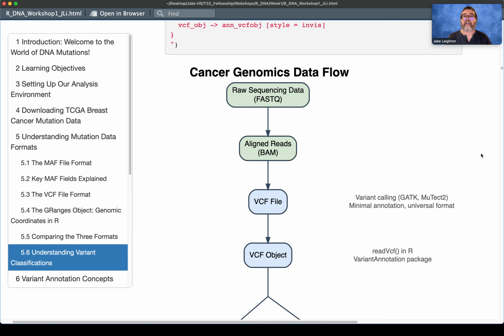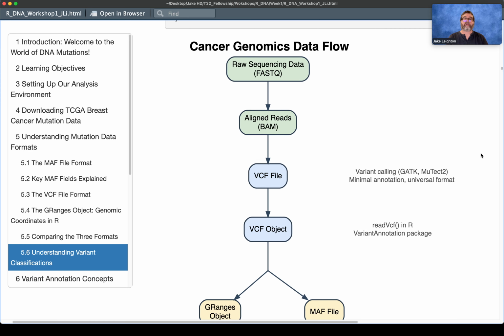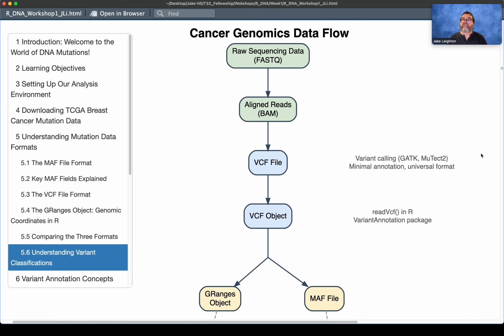So now you know a little bit about the overview of those files, and this is how they go together in a basic cancer genomics workflow. So when you do a sequencing run, let's say we're looking at mutations, you get all the data, and it's really a big mess and complicated. The first thing you do is demultiplex those files. You basically put the data back into FASTQ files, which is what you always see, right? A FASTQ file gives you all the base pair changes and everything that the different reads saw that seem different, but they're not really aligned to our genome.